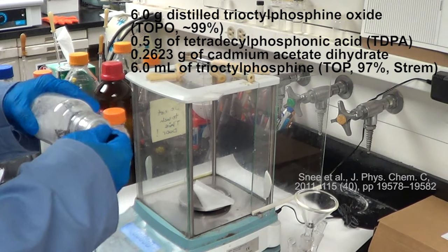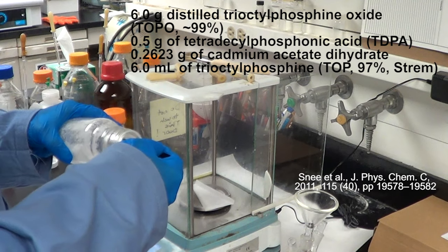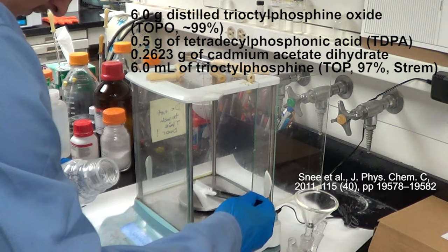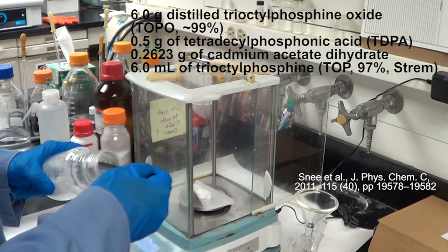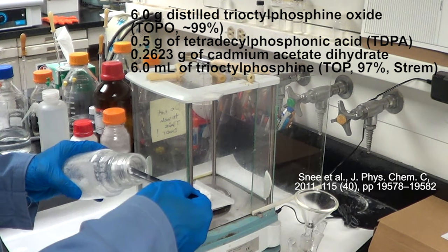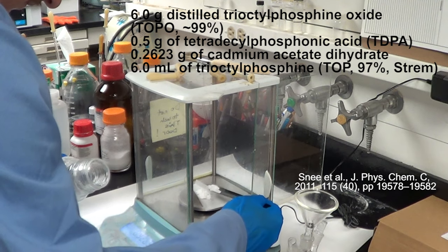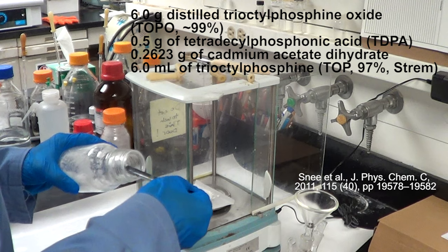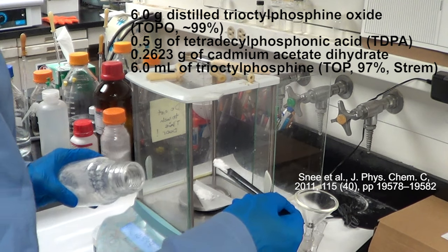Alright, we are going to make cadmium selenide quantum dots today, starting by weighing out some dry chemicals such as tri-octyl phosphine oxide. It's not air sensitive and has a nominal purity of 99% that we prepared by distillation, starting with a 90% pure product. There are commercial vendors that sell 99% purity TOPO and other ways of purifying TOPO if you just Google that.